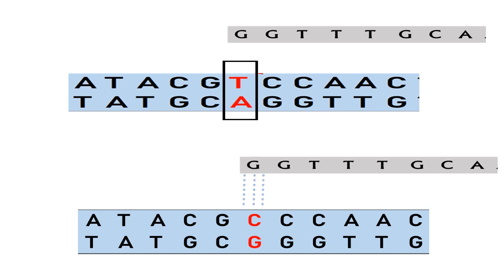This is a single primer and it will try to attach to both DNA sequences because it is present in both the DNA PCR tubes, in every PCR tube. So it will try to attach to the DNA sequence. But let us see which DNA it is able to attach to and to which DNA it will not get attached. One DNA has a T allele and the other has a C allele, and this primer will try to attach to both DNA molecules.